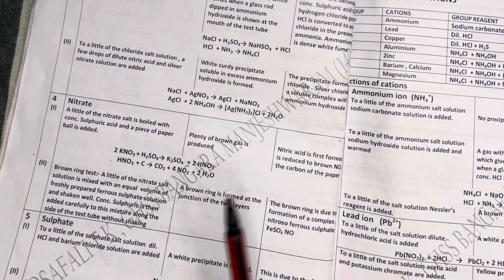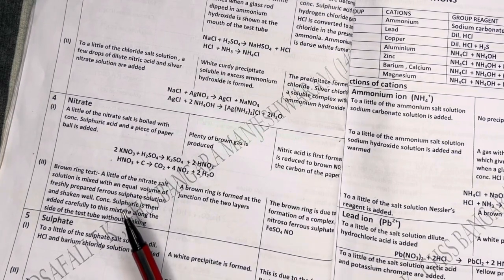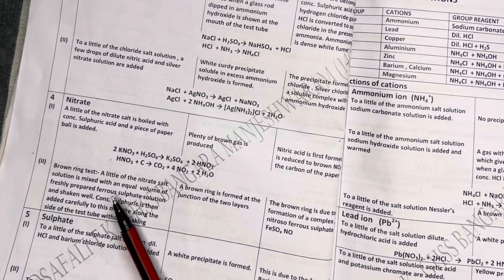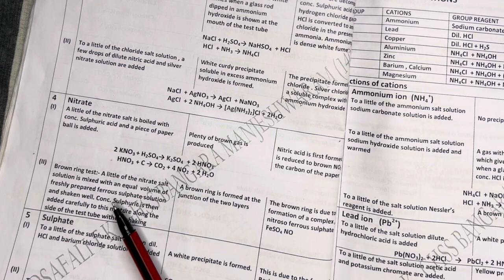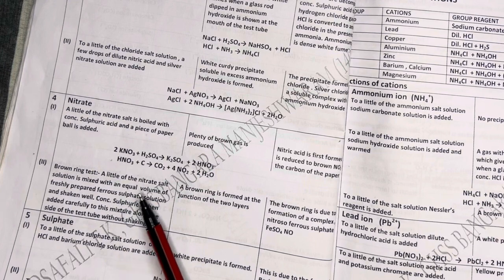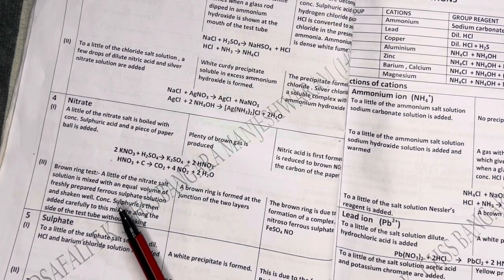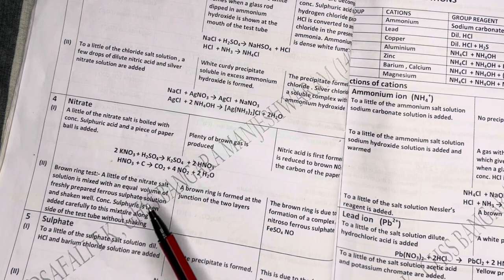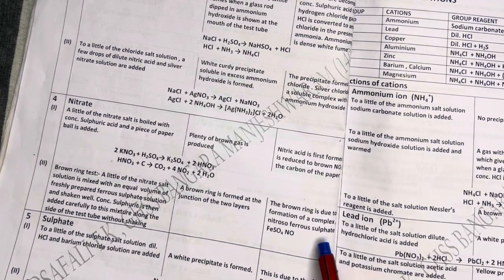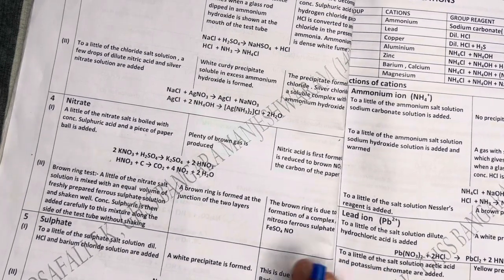Again, the next is the brown ring test, which is a major confirmatory test for the nitrate. A little of the salt solution is mixed with an equal volume of freshly prepared ferrous sulfate solution, and concentrated sulfuric acid is then added along the side of the test tube, without shaking. If you get a brown ring at the junction, then it indicates the presence of nitrate.